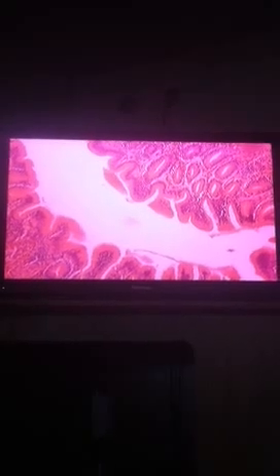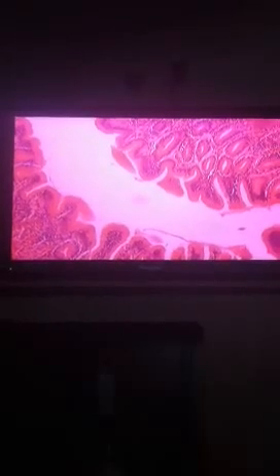Now, as we move across, let's back off just a little. Oops, went the wrong direction. These are a little different. This is actually down into the pyloric region. So again, you can see the stomach with the rugae. Let me kind of pick it up one more time.